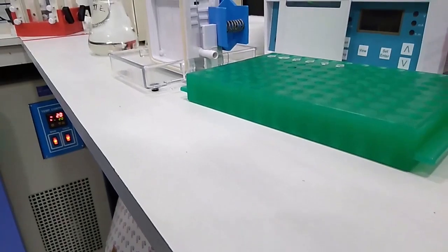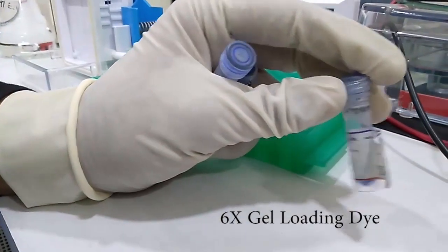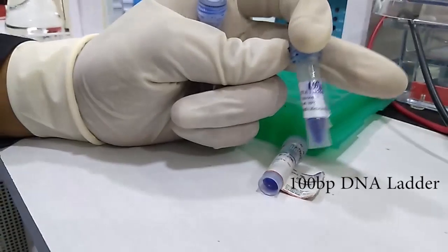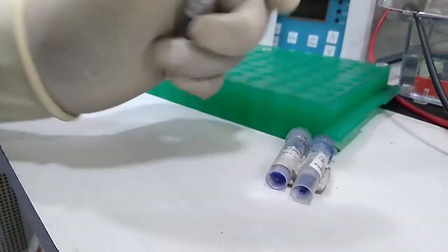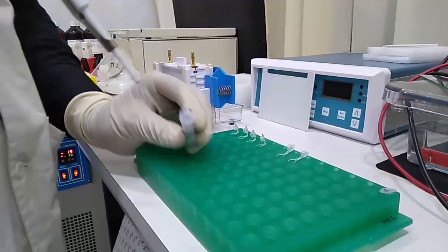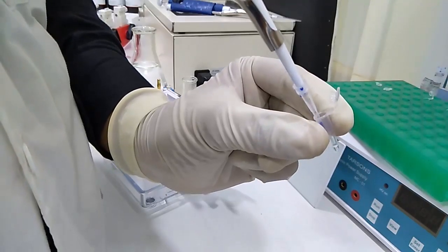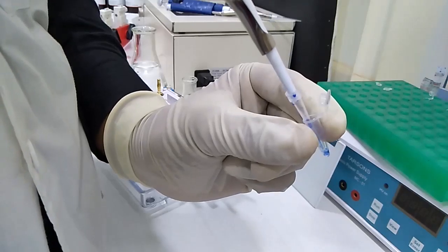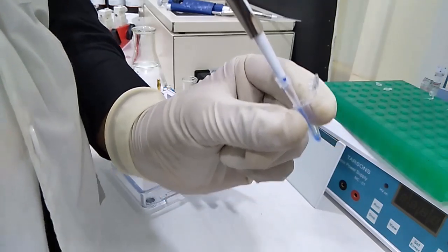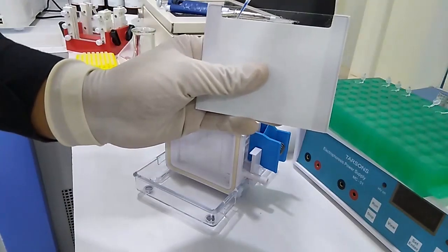For loading the sample we need this 6x gel loading dye. We need 100bp ladder and another is 1kb ladder. Now I will mix the 6x gel loading dye. We are mixing it in that manner. Now I will load the sample in that manner to the polyacrylamide gel.